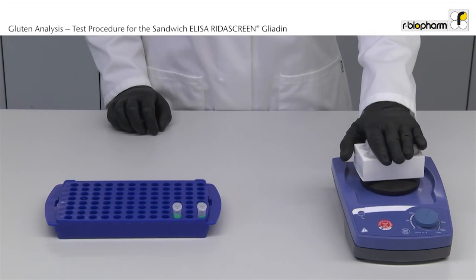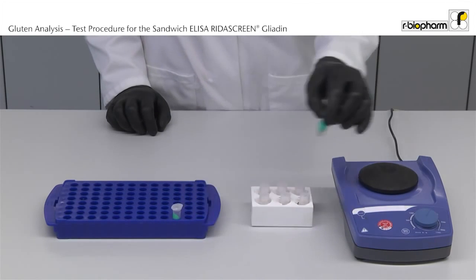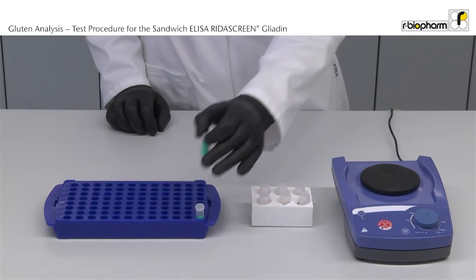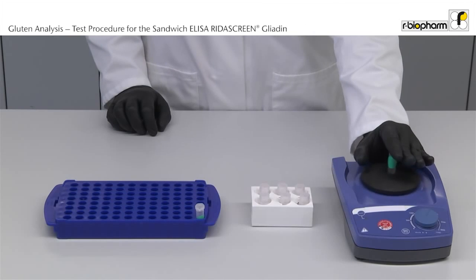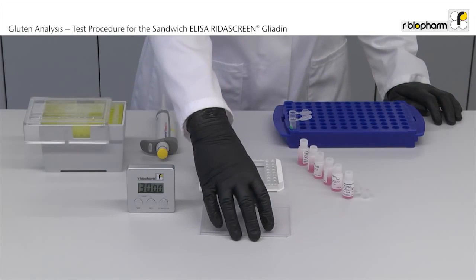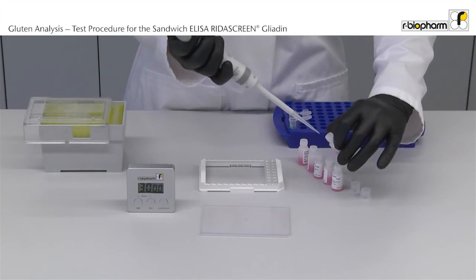Mix the standards and samples before use. Pipet 100 microliter of sample or standard per well in duplicate. To save time, all vials are already open.